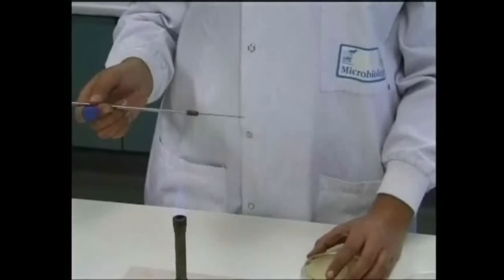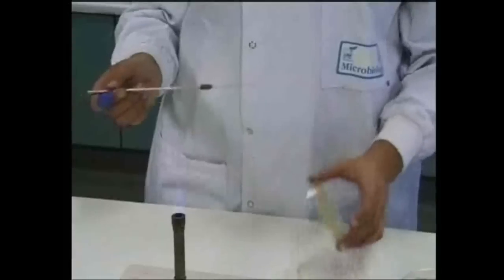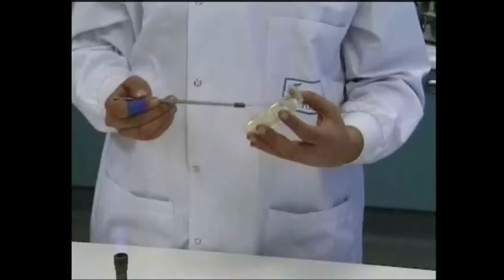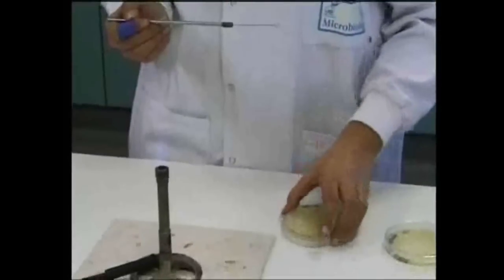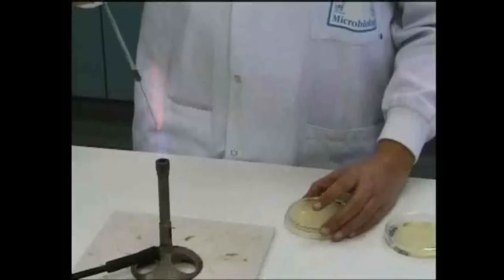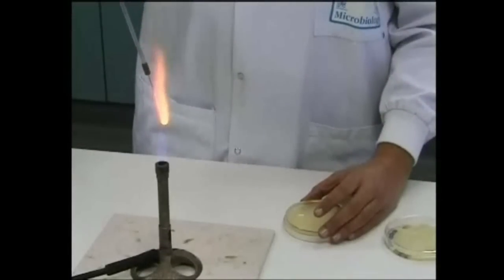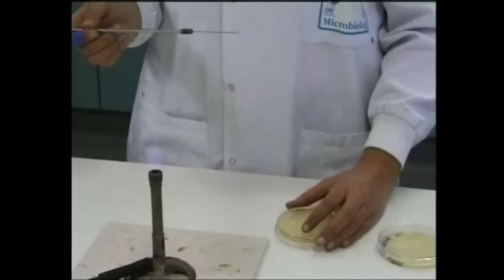The second sector of the plate should now be streaked by drawing some of the original inoculum from the first sector with the sterilized loop. Again, the lid is replaced and the loop flamed and cooled before streaking the third area of the plate, drawing from the second streak.